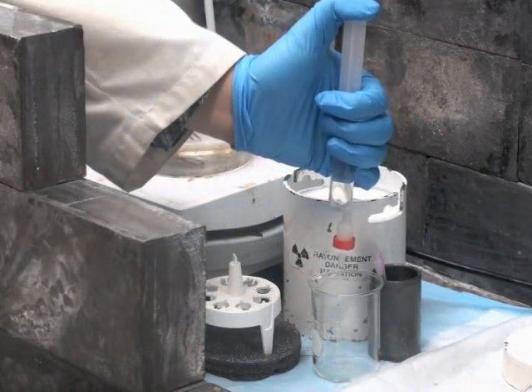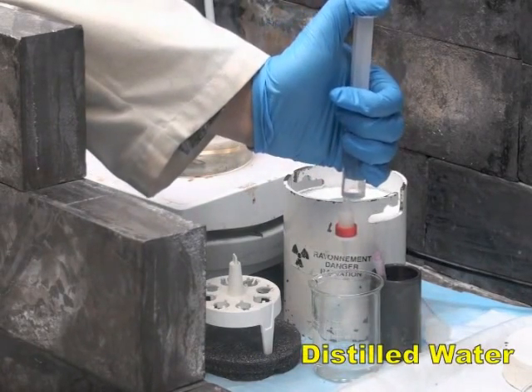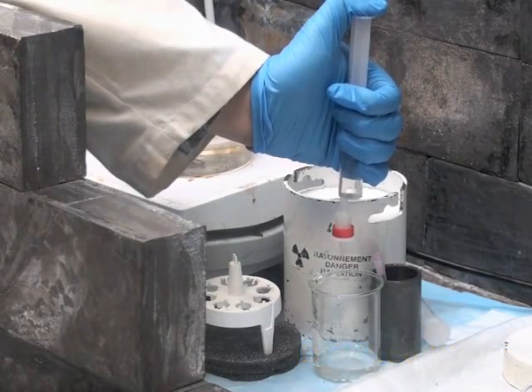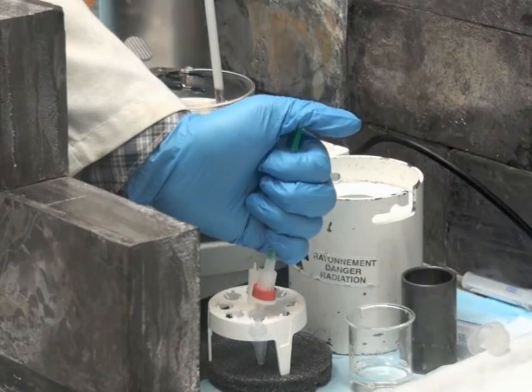Load the mixture onto the pre-conditioned C18 cartridge. Wash the cartridge with distilled water, and elute the trapped fluorine-18 labeled SIFA peptide from the C18 cartridge with ethanol.